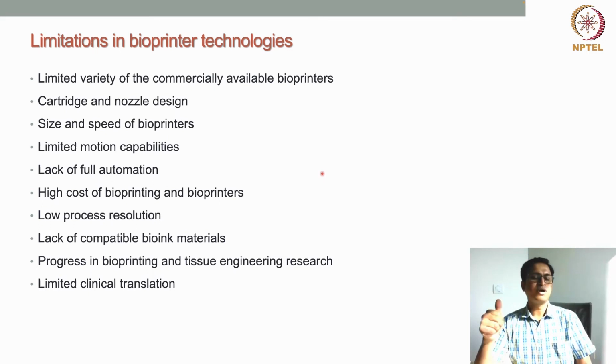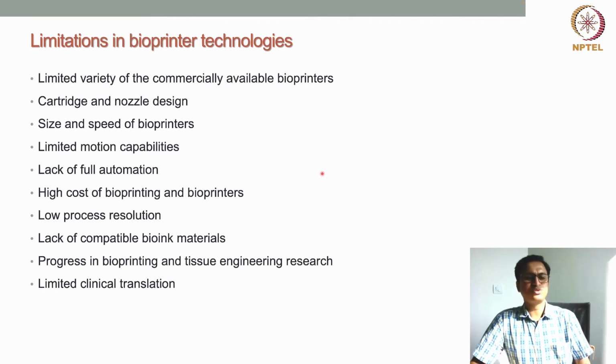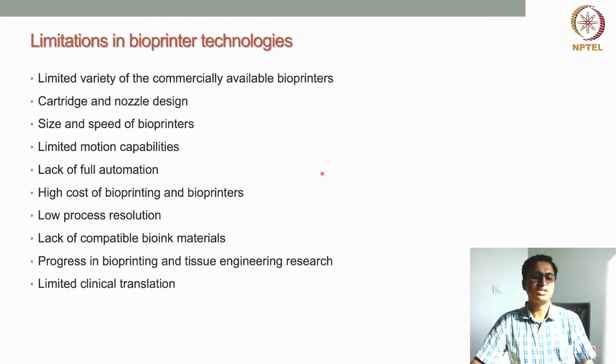Another thing is that most of the bioprinting technologies and bioprinters are very expensive. So the high cost of the bioprinters is a deterrent for widespread usage or availability of these bioprinters. So the cost of the bioprinters and bioprinting technologies is also something that should be addressed.